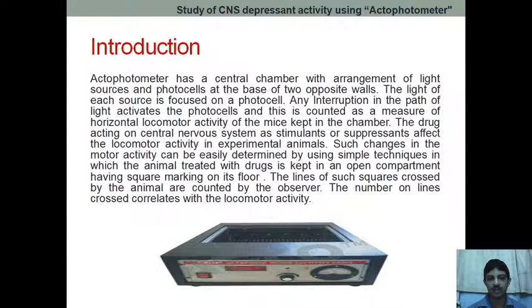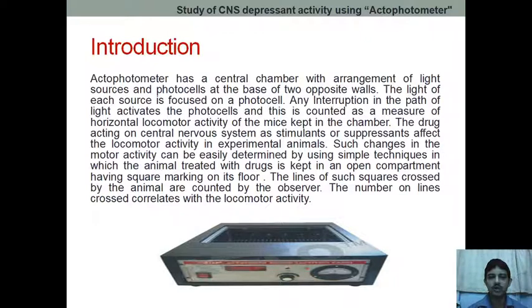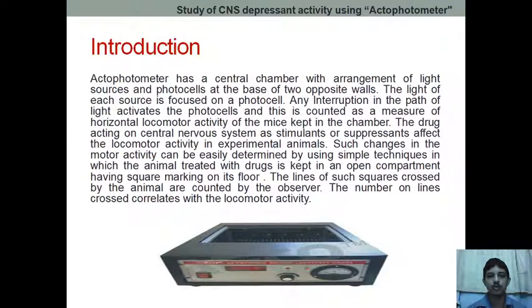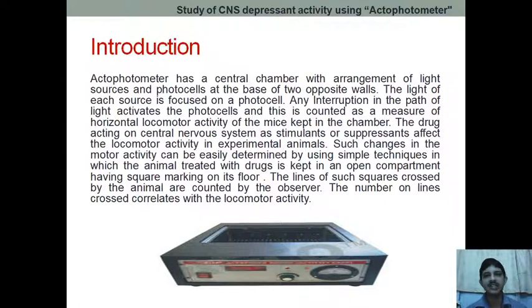This instrument is very helpful to evaluate drugs acting on the central nervous system — whether CNS stimulatory or CNS depressant. Here you can find grid lines also. We can apply electric shock as well, but if we do, we must remember to give the same type of electric shock to both the control and drug-treated groups, otherwise it will alter our experimental results.